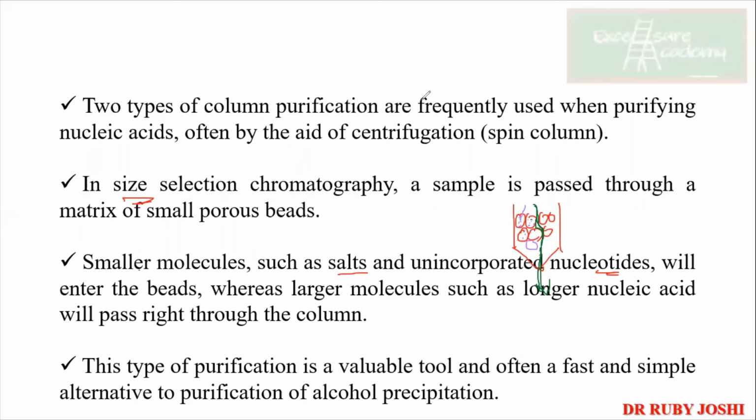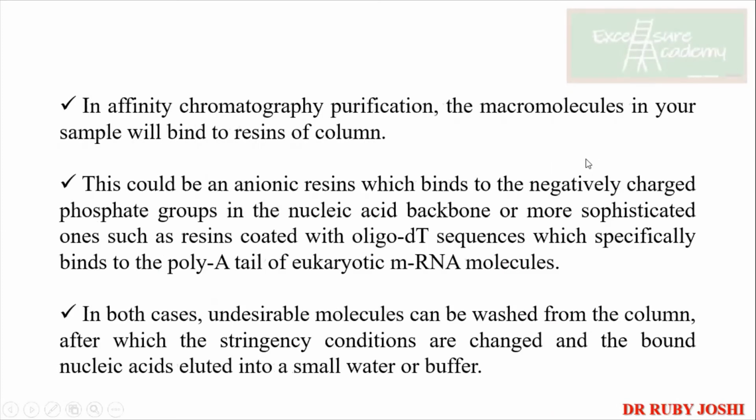Okay. We'll come to this. This is also very important. Many numericals are also based on this size selection or size exclusion chromatography. It is also known as gel permeation chromatography. Many names are there. Now coming to the affinity chromatography.